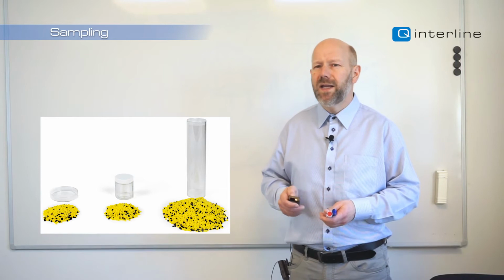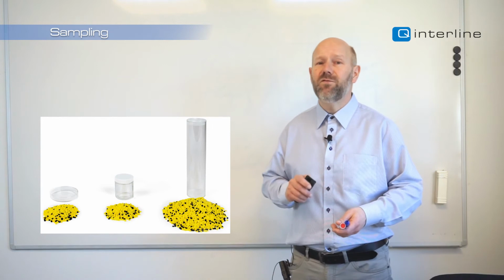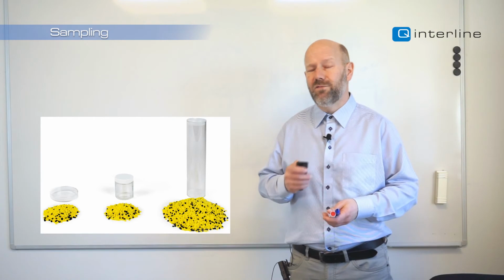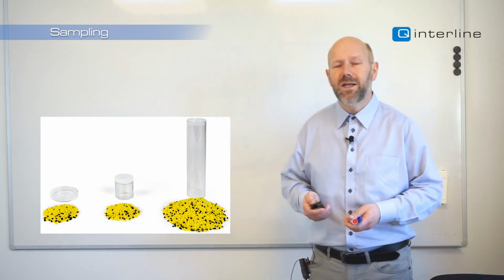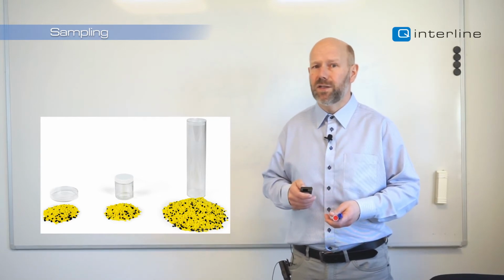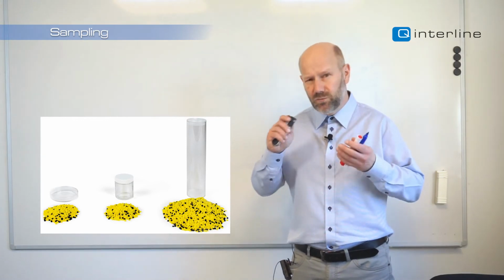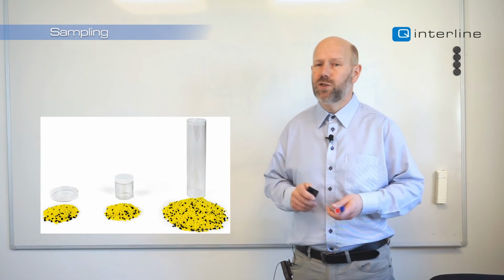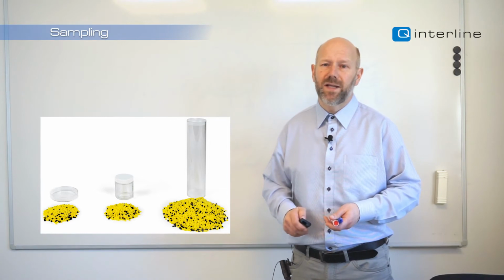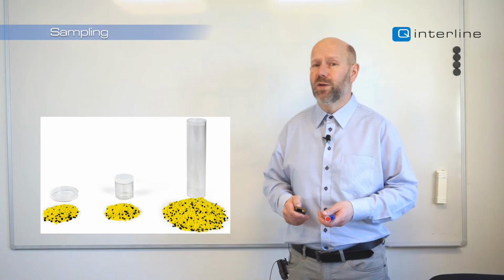We produced a binary mixture of polyethylene and polystyrene because they have very, very different spectra. We created mixtures of 2 and 5 and 10 and 20% of these mixtures by weight, which can be done very, very accurately. We corrected for volume so that it's really a true mix volume of these two. We made a calibration, and that calibration is of course quite easy to produce because it requires only 2 components.